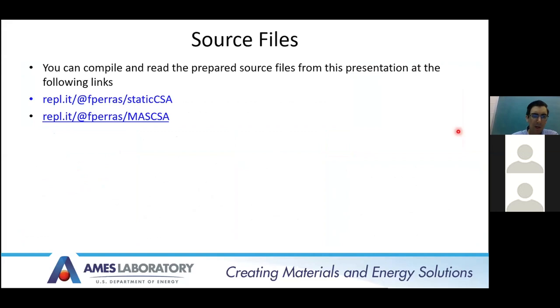So the idea for this talk is that I wrote a couple of bare bones C/C++ programs for the simulation of static and MAS NMR spectra. I attempted to write these in as little code as possible, and you can download and run them at these websites here. It's an online compiler. I tried to write them in such a way that they would be easy to modify to suit the needs of whoever wants to get into programming for NMR.